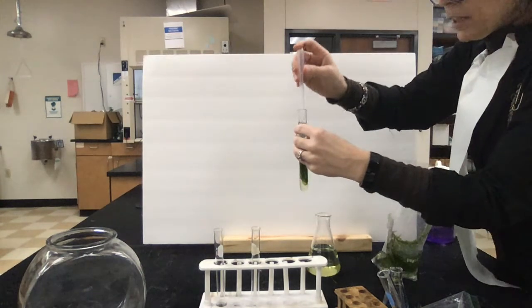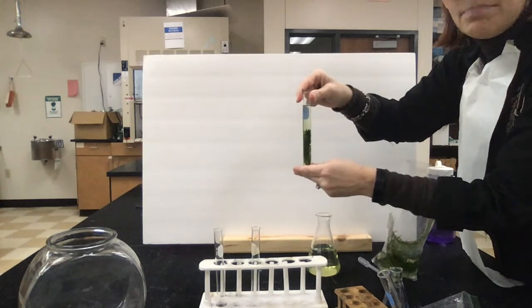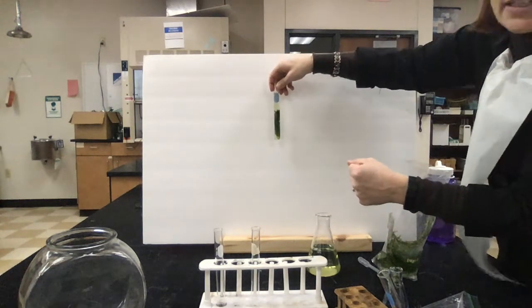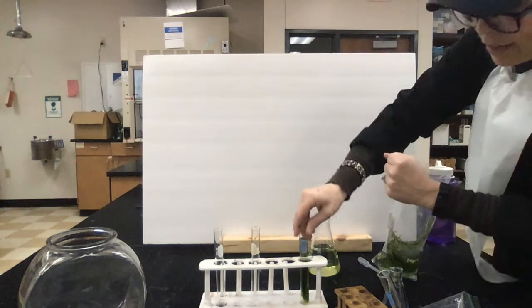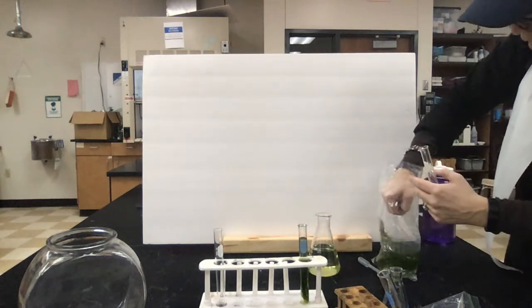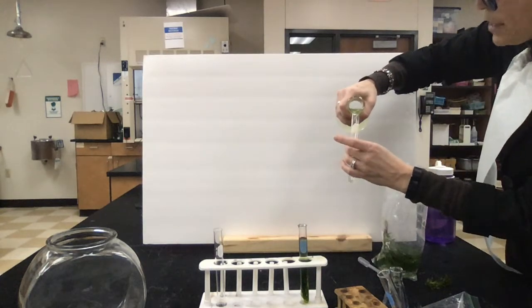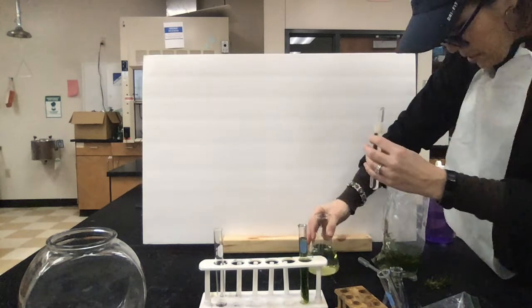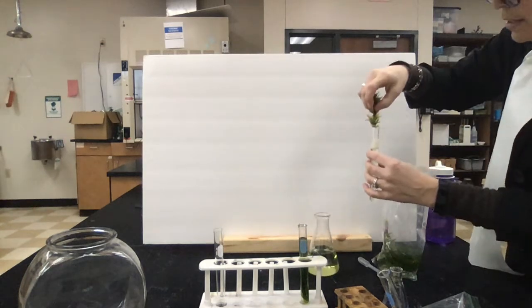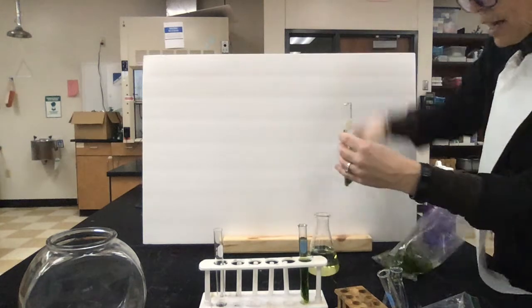And then we're going to put a stopper. You'll just have to trust me that I'm going to put a stopper on. I don't have the stopper handy. But you can see that it's still that yellow color. And then I'm going to do that 3 times in 3 different test tubes so that we can watch it progress over the day today. I'll add a second one here, shove it down. And then I'm going to place these in the light.